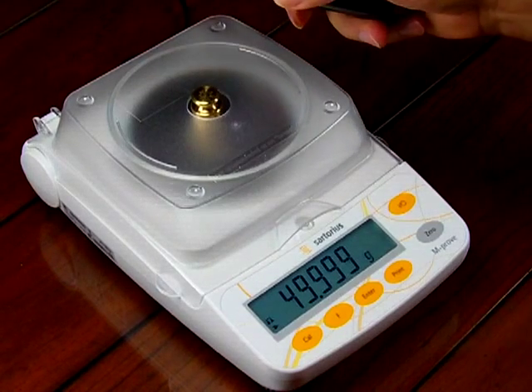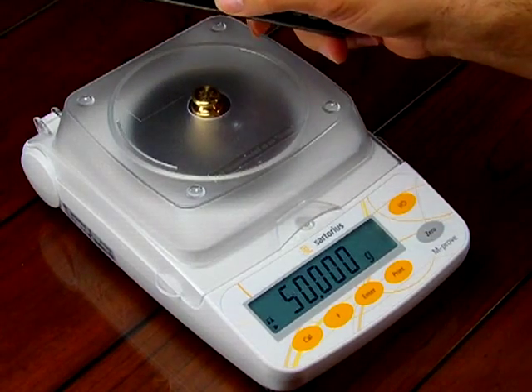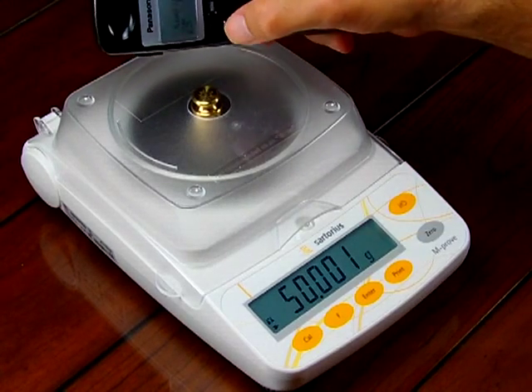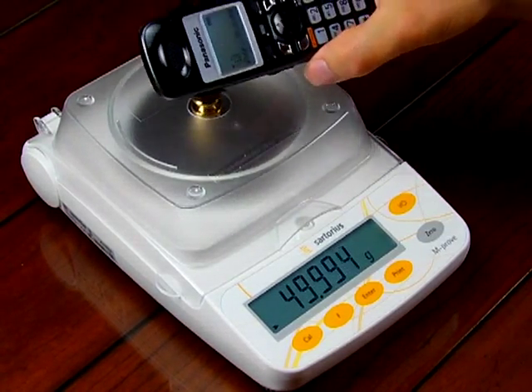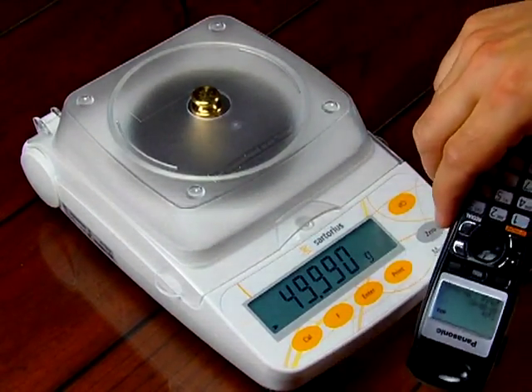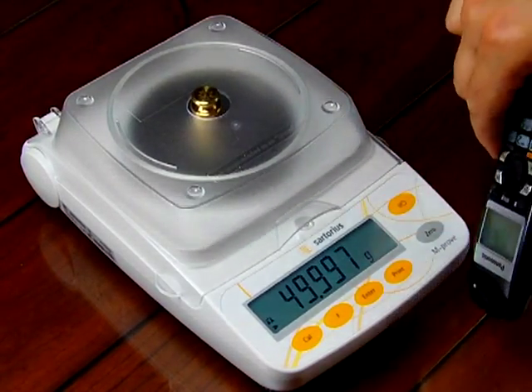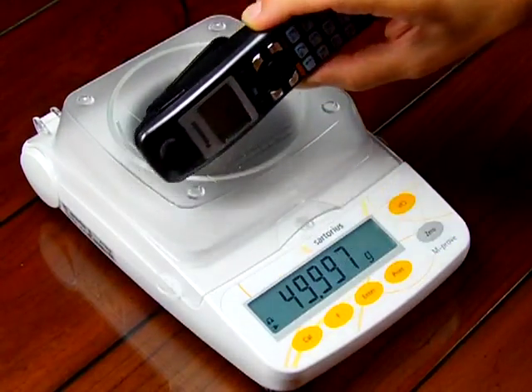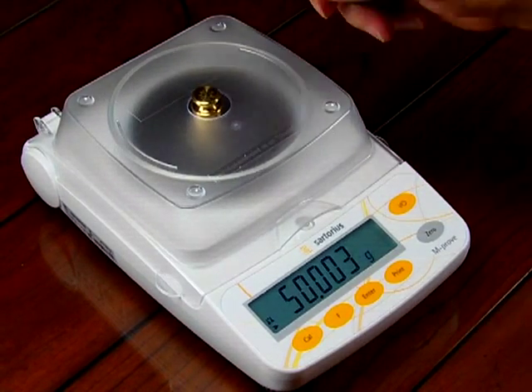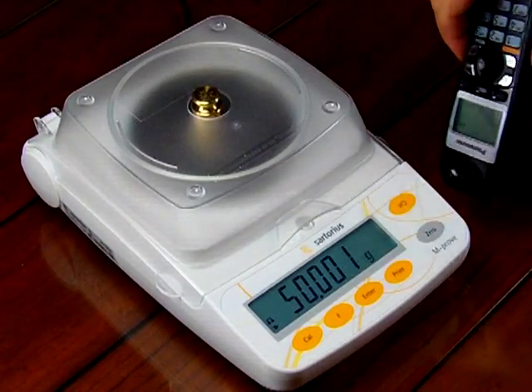So what I want to do is turn this telephone on. This is the talk button over here on the left. Watch the display when I turn it on — I'm going to press the talk button. The phone is now on. And look at the numbers go all over the place. If I move the phone around, the numbers go all over the place. That's electronic noise. This handheld phone is, I believe, 900 megahertz. It's emitting a frequency, and it's actually affecting the balance.